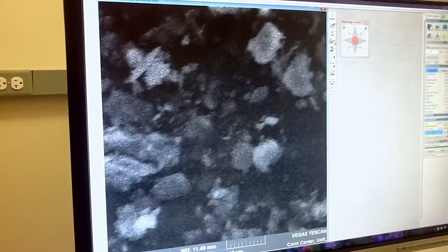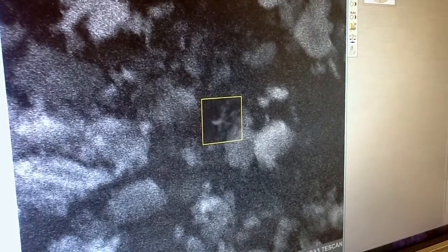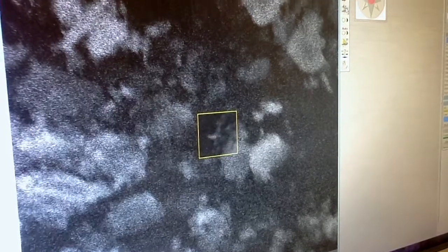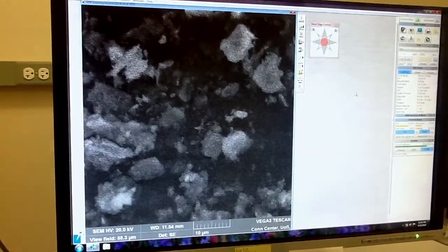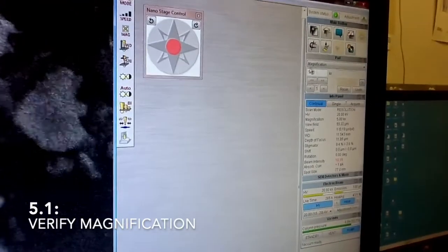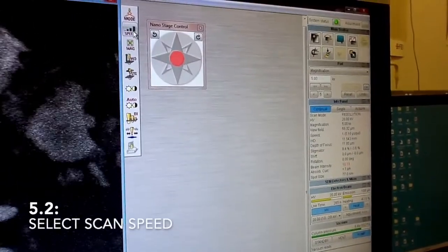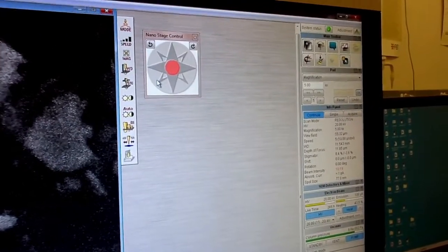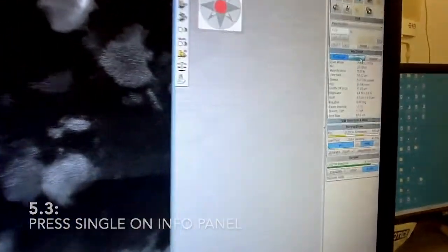You can also use this view window which gives you a very fast response. Just make sure that the image is as sharp as possible, moving back and forth between stigmation and focus. Once you have a good image, make sure you have the right magnification. For a less noisy image, just press single — this is one of the ways of capturing the image.